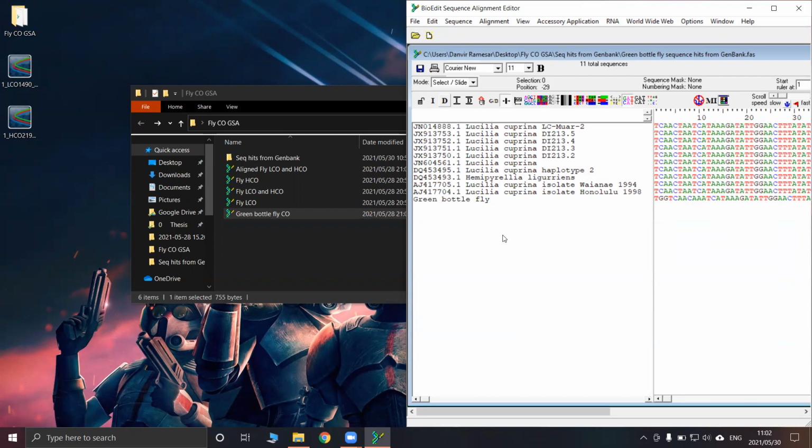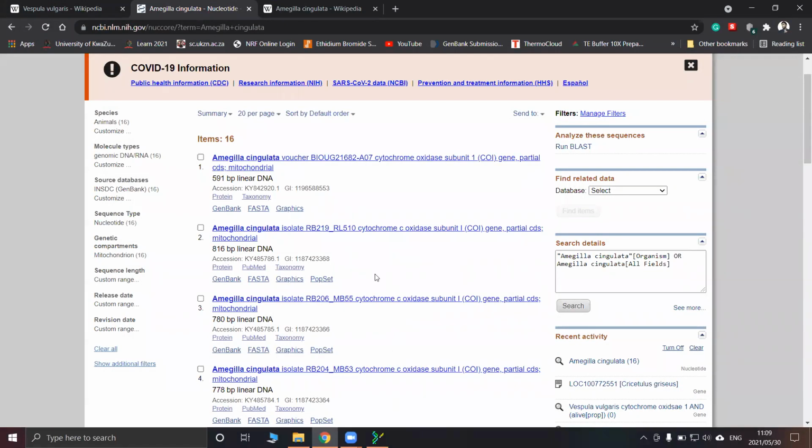But since we are working with insects, once we have polished up the BLAST hits and copied our consensus sequence into these, sometimes you can even get a bit more if you know a reference cytochrome oxidase sequence of a bee. You can very easily just search examples of the genus name of a candidate bee.